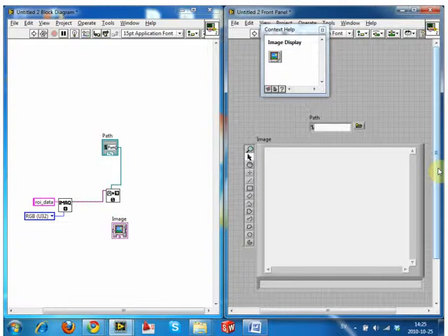Okay? There were two of them. Yeah, go to image display or display classic. What is the difference? One looks old and funky, and one has the new display. There's similar things in lots of things with the front panel. You can choose the classic toolbar, which has older style buttons, and the new one has modern style buttons.